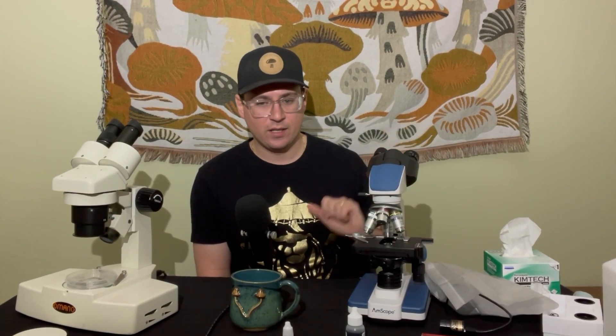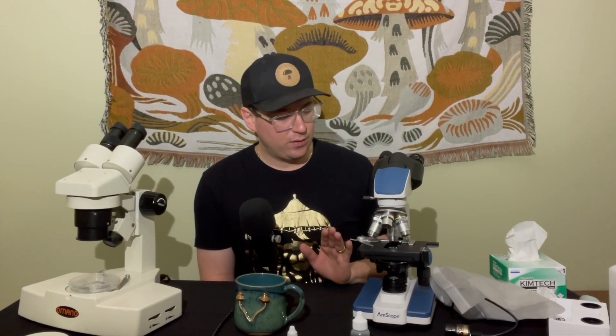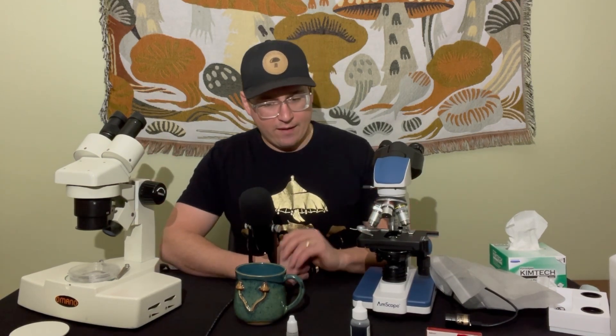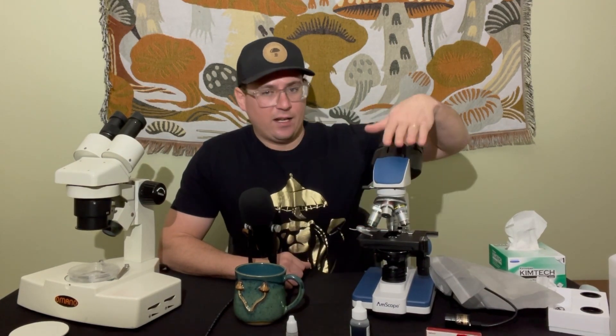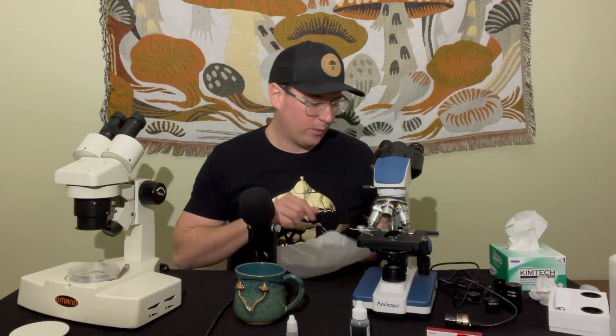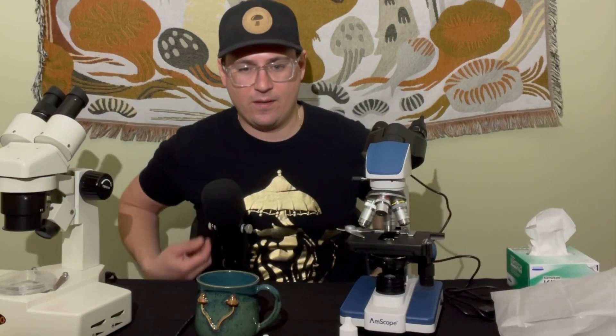If you have a serious problem with your microscope, I recommend calling a professional for any hardcore maintenance beyond just cleaning. There are very fine, sensitive adjustments — especially with the objective lenses — that a professional can calibrate. It usually costs around $100–$200 for someone to come and service your microscope. If you don't have a very expensive one, it might be worth investing in a new scope — the AM Scopes are pretty affordable and top-notch these days, especially the ones with cameras. When in doubt, hire it out.